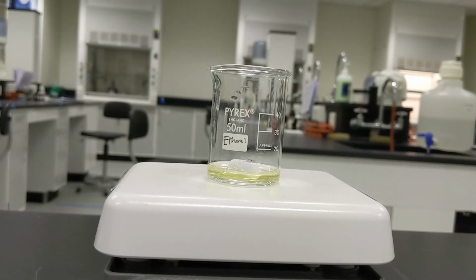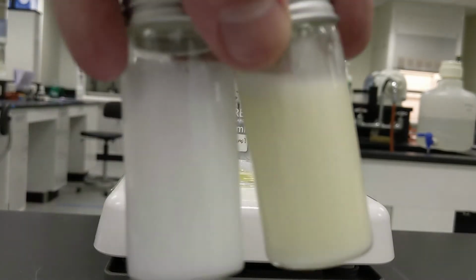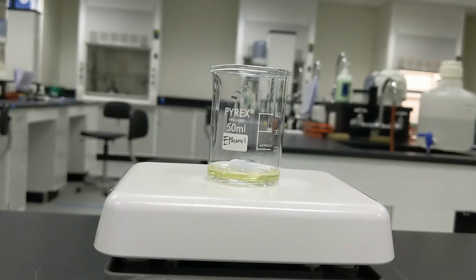So we'll set up some sort of time lapse here. Again, we'll leave our emulsions for a few minutes while we see what happens to this egg white. All right, so here we go.